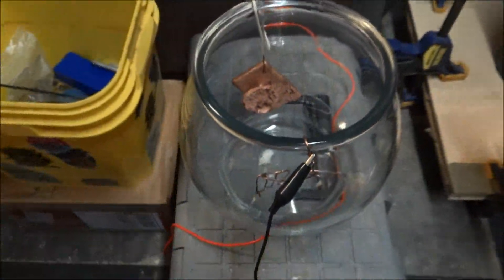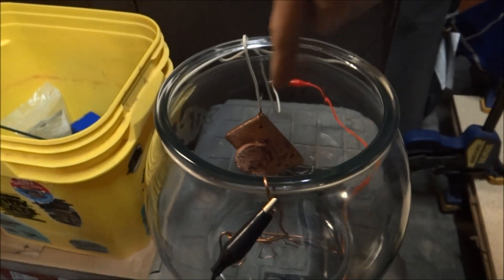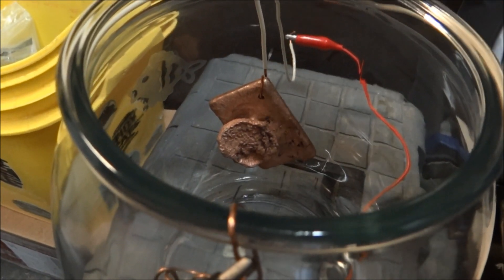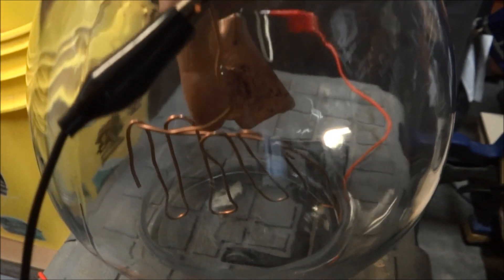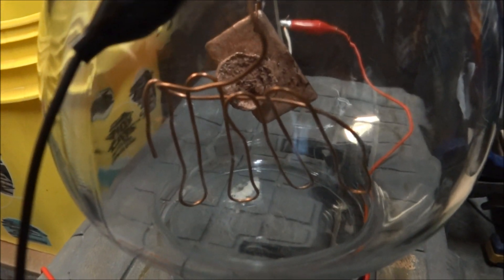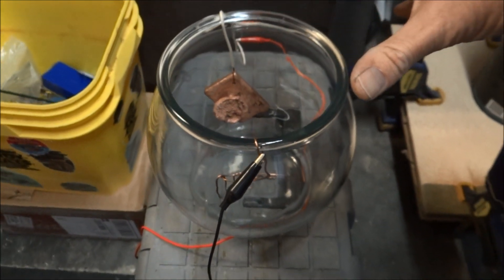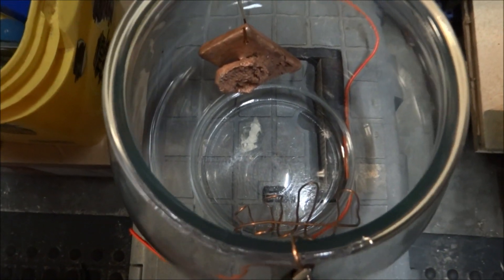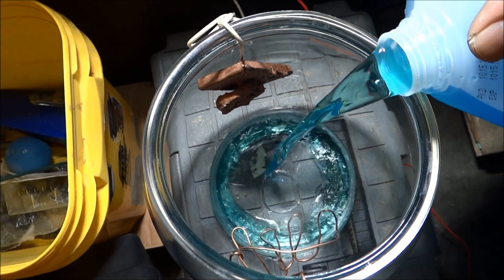Here's my cell - this is just an old fishbowl. Hanging right here is my anode, the piece of copper that we poured - that's another video out there, it's kind of crappy, so we're going to use that. Then this one right here is another piece of clean copper - that's going to be our cathode. I'm going to fill this up with our blue fluid and let the magic happen. Now we're going to add our copper sulfate water mixture.